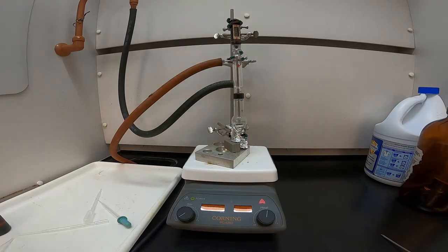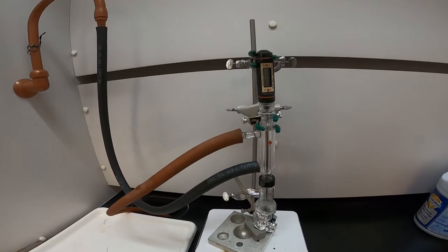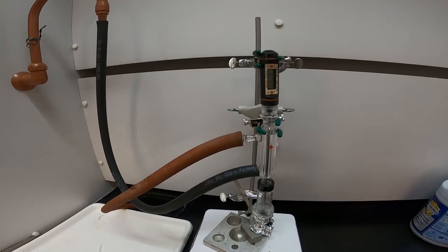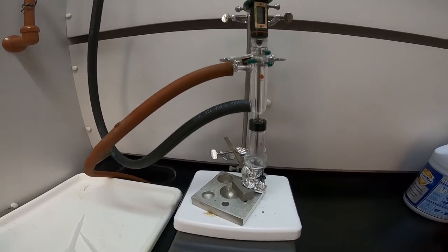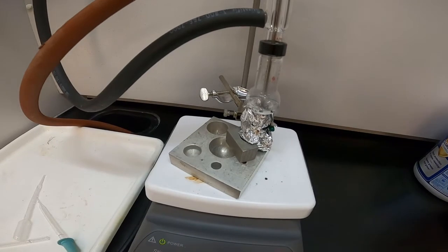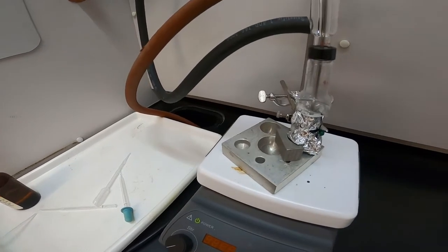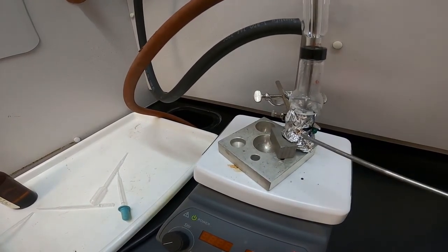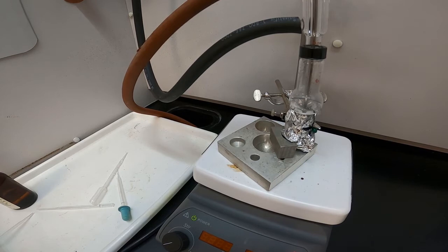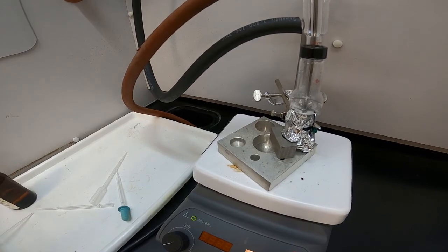You can see the thermometer, it's been hovering between about 140 to 143. So we can accurately read that the boiling temperature, I'm going to say, is 141.8, 142 is good. And then if we look really, really close at the distillation collection head, you can see where the liquid is in the little neck here. So the next step is I'm going to turn it all off and let it cool, and then we'll collect the liquid and mass the amount of liquid that we've created.